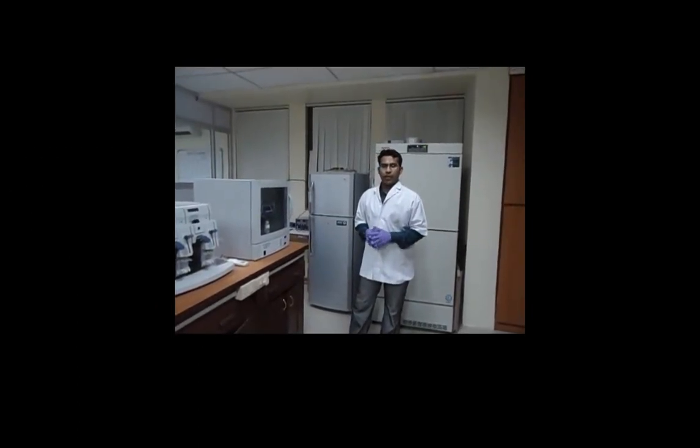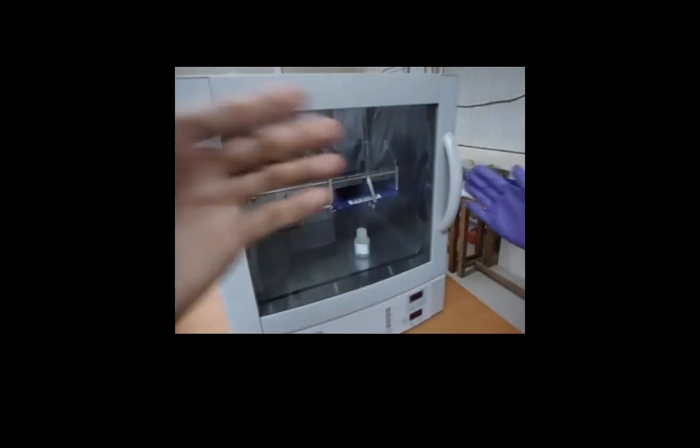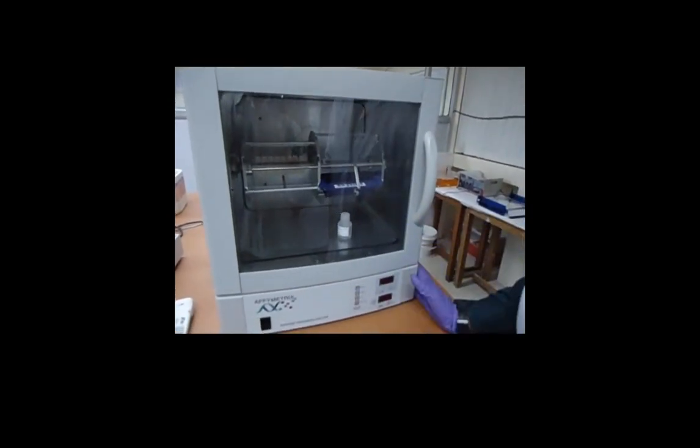Microarray technology is hybridization, in which the nucleic acid, that is the DNA or RNA, binds complementarily to the probes which are affixed on the microarray chip. Here is the gene chip hybridization oven 645 chamber. Here is the hybridization unit. In this, the chips which are applied with RNA solution are kept for the hybridization procedure.